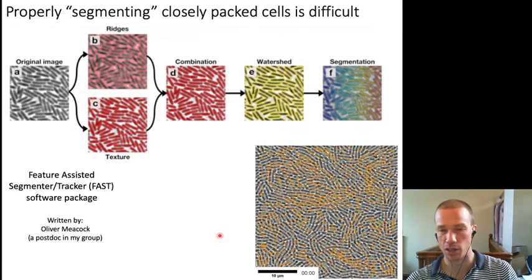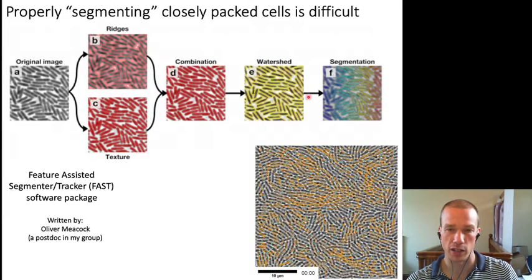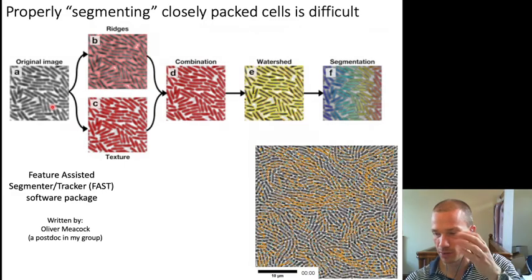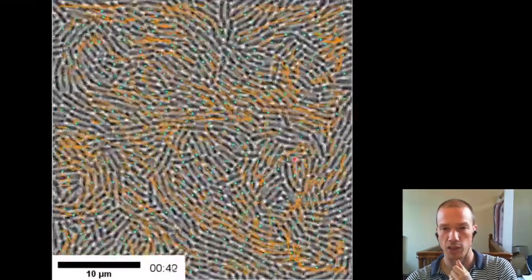So phase contrast creates these halo artifacts, which, in this case, where we're using positive phase contrast, are brighter around the cells. But that actually helps you out in this case, because it boosts the contrast. It gives you a cleaner edge to these cells, which you can use something called watershed to delineate the edges of individual cells, which you can then subtract from your original images to better distinguish these individual cells and draw a line in between them where two cells are touching, to allow you to segment them properly. So if you do this the right way, you can use this increased contrast, which is afforded by phase contrast, to actually track individual cells when they're collectively moving.